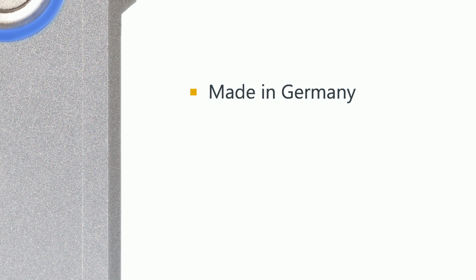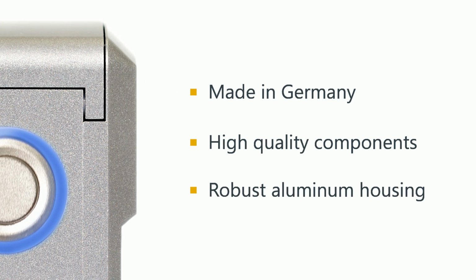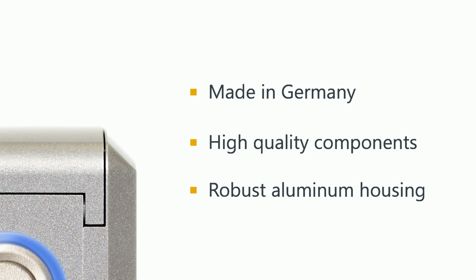Completely manufactured in Germany, featuring high-quality components inside and a robust aluminum housing on the outside, we believe the MSA is a milestone in the field of surface science.